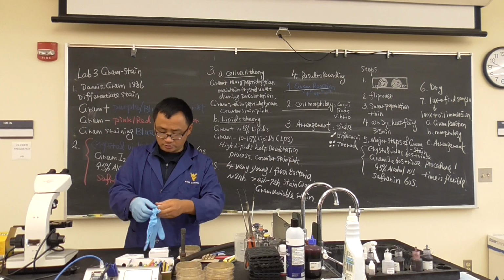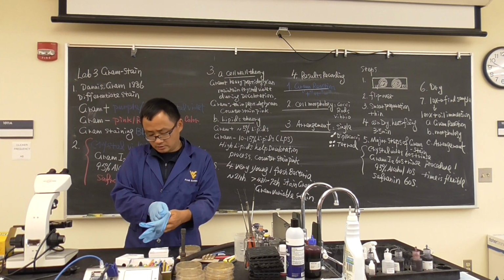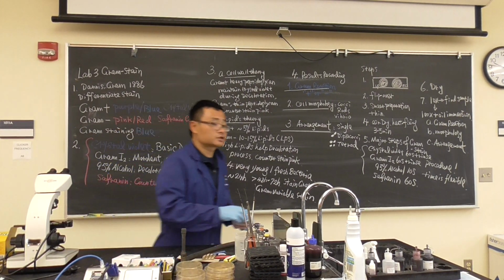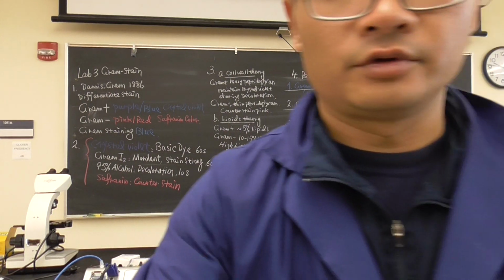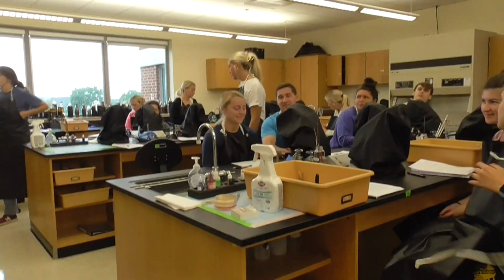So let's, okay, so now everybody, let's go right here. Okay, let's go right here. And we will be moving this here so the other people could see it. Okay, we'll move here.